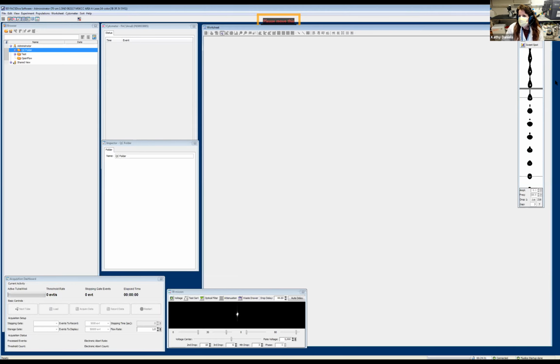Okay. So with that being said, and now that I have this spotlight on my mouse, which I think will be very helpful, after I make sure that these droplets all look as expected, the next thing I'm going to do, after the optical configuration we did a little bit earlier that we're not going to go over today, is make sure our setup is correct so that we have the appropriate drop charge delay that Derek was talking about in some of his slides, okay?